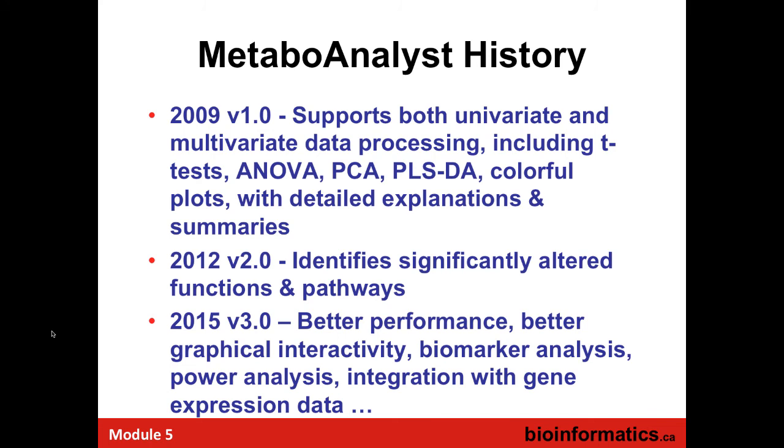So the first version came out in 2009, and that introduced most of the major statistical techniques that Jeff explained. It introduced a lot of the color plots. It introduced the workflow. Version 2 added a number of other tools for higher level interpretation, metabolite set enrichment, and pathway analysis, and ROC curve analysis. And then 2015 enhanced things much more, improved the performance overall, added power analysis integrated with gene expression, and so on. So that's the current version. And it's always being improved, with Jeff working on additions, and then my lab as well doing a few things to update it.